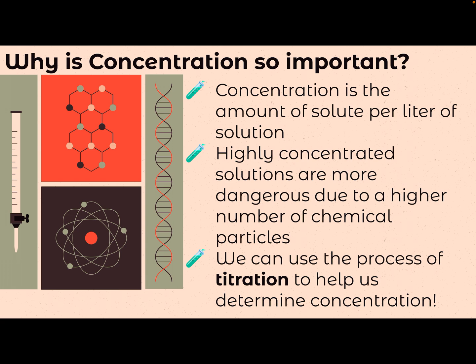So if I say, hey, we're working with nitric acid tomorrow, you might think, ooh, spooky, scary. But if the concentration of that nitric acid happens to be something like 0.1 molar, a very, very small number, honestly, it's basically like working with mostly water. So concentration is super important. If you spilled 0.1 molar acid on you, no big deal, right?